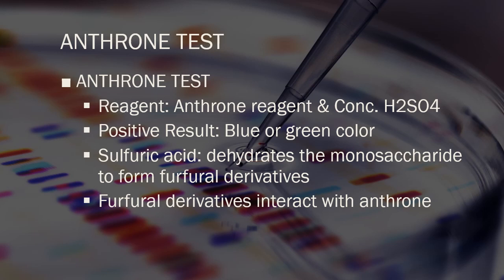In your glycolipid test, you have your sample, and you have your anthrone test and your Molisch test. The other reagent that was given to us in the laboratory was your Molisch test. It was the Molisch test that you did.